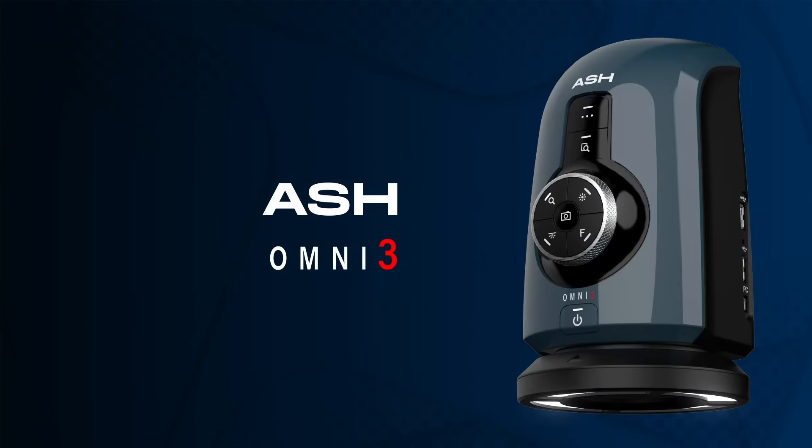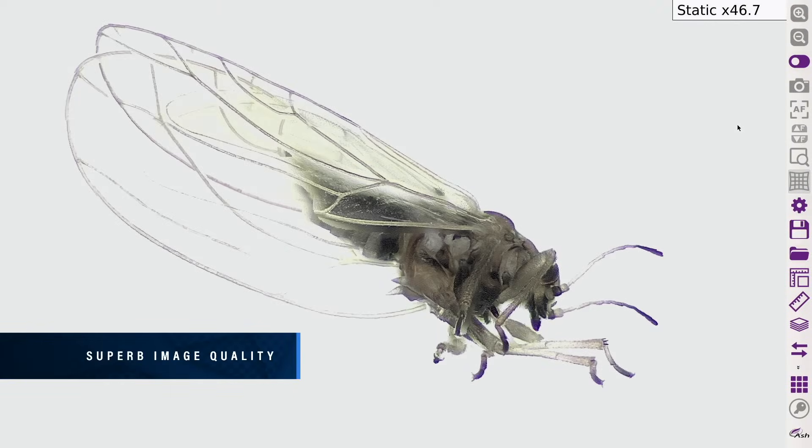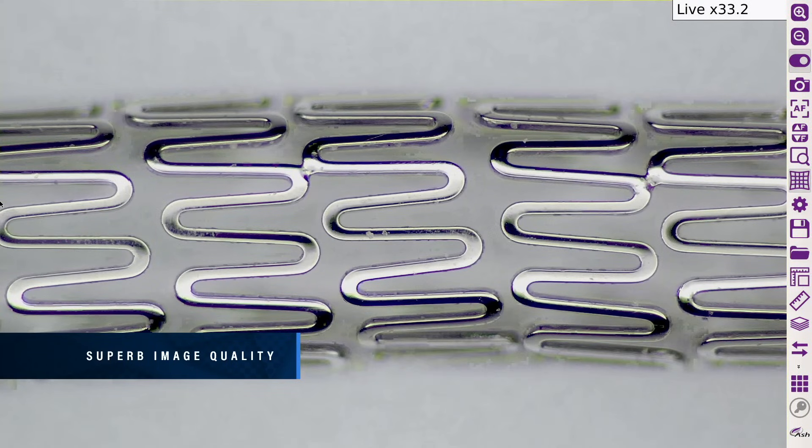Omni 3 Digital Microscope and Measurement System incorporates the AshCam Plus, a 30x zoom lens camera module with a host of new benefits for smarter inspection and measurement. Experience unrivalled, crystal clear, full HD image quality from the powerful AshCam Plus, specifically for critical inspection and measurement tasks.